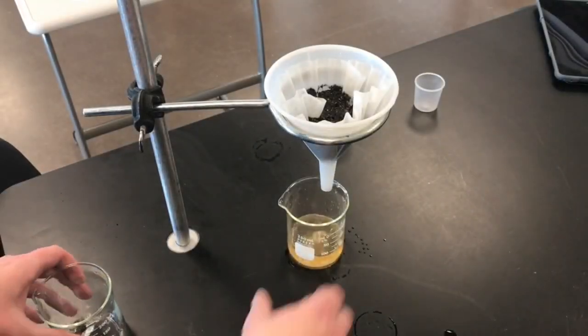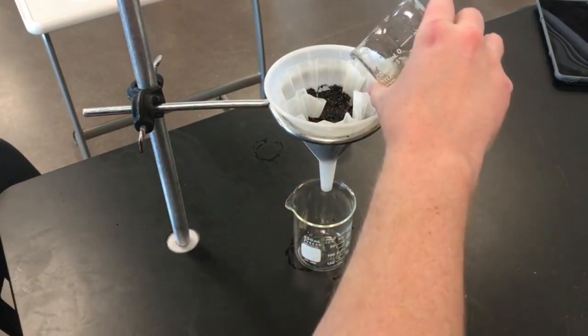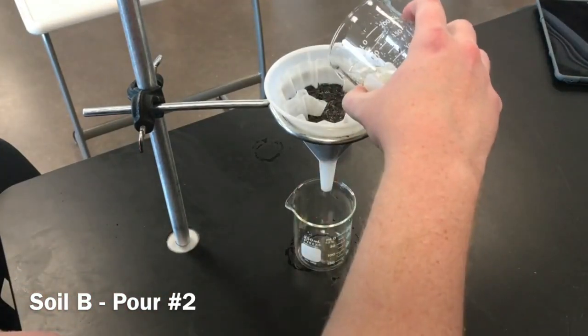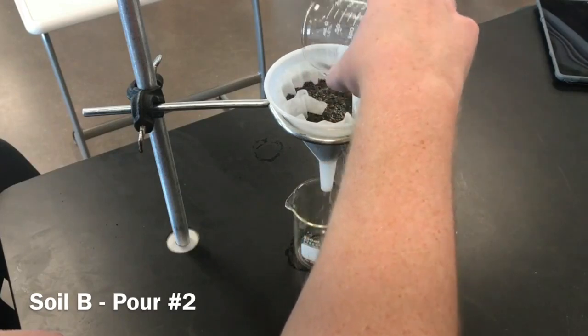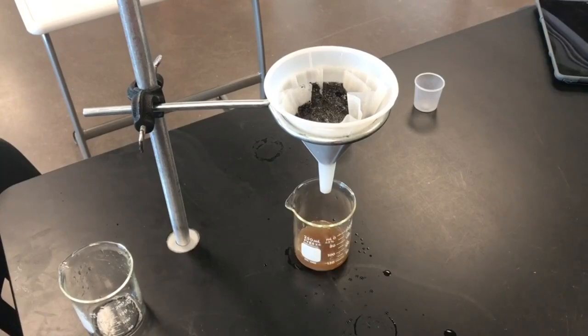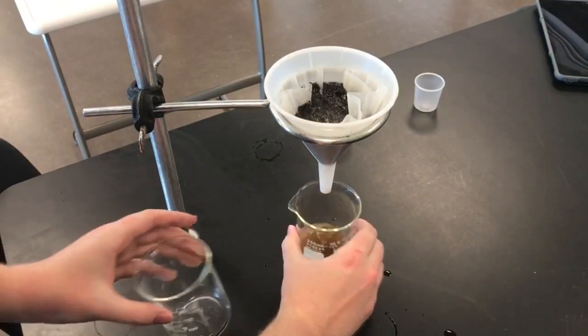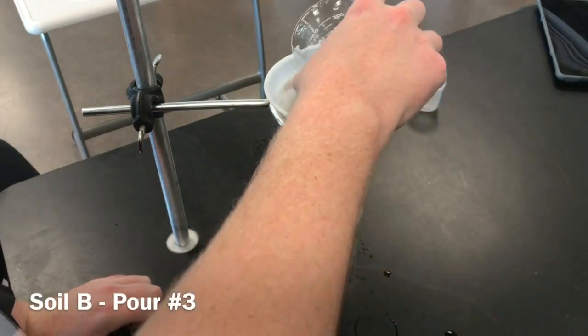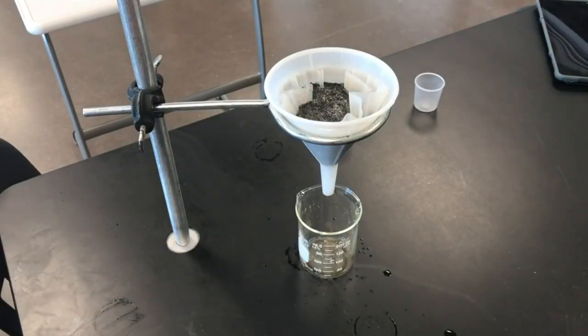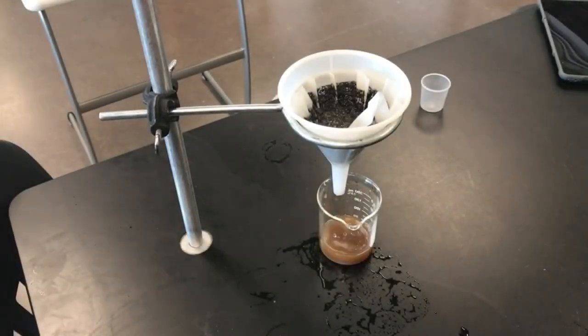Looks good for the first filter. Again, we're going to do this 3 times. So I'll run it through 3 times. All right, I'll run it through one more time here. And it's very possible that this last one will take quite a while, so just be patient as it filters through the very end here. All right, looks like it's finishing up here.